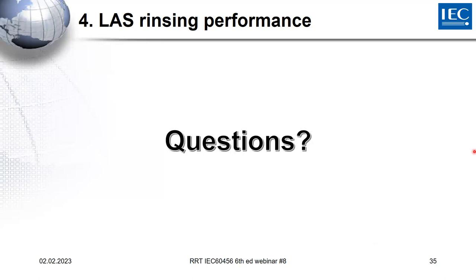Yes, that was the reason for my hint. Additionally, it's also what Markus already mentioned. You should not prepare only small volumes. You can prepare larger volumes and store them in high density HDPE containers. That is also very good, and the water keeps its quality. But nevertheless, when you open this container, you should check the water. In our laboratory, we always check the quality of the water. That's it from my side.